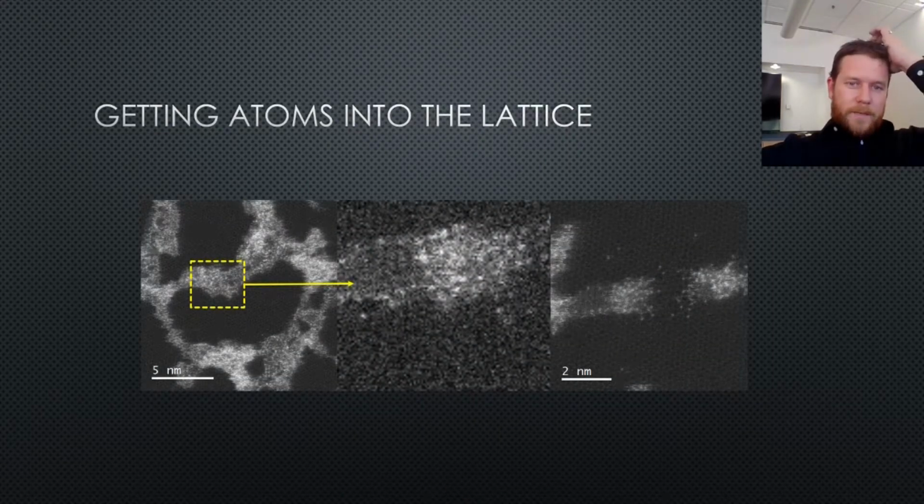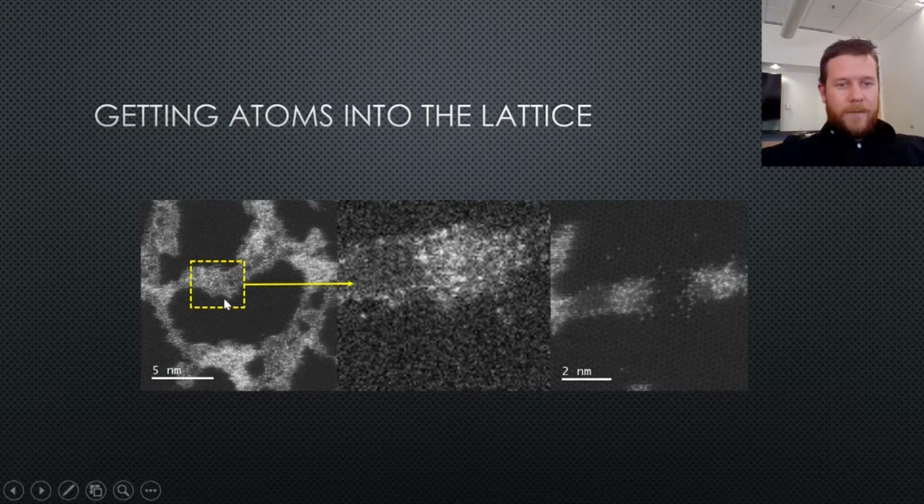On the last slide, you get one defect for your efforts. And since I'm the one creating the defects, I decided I need a faster way to put them in the lattice. So I came up with a different technique, and that is we just define a subscan box over some region like this, and the subscan box can be moved with your mouse across both the pristine lattice and the source material.